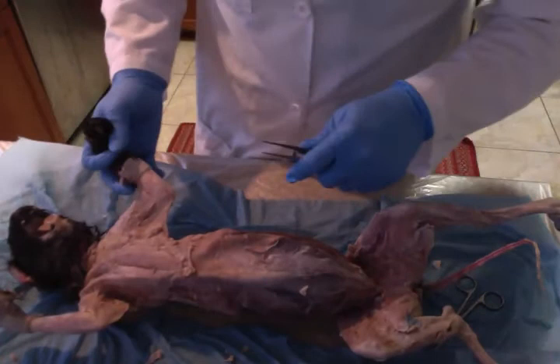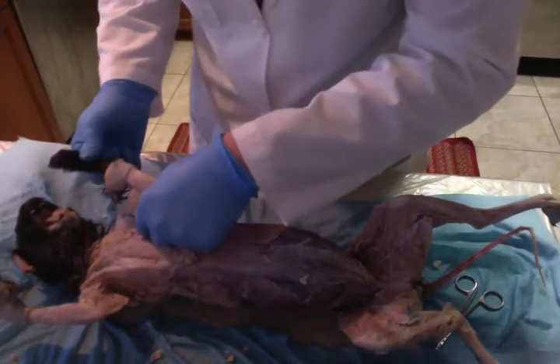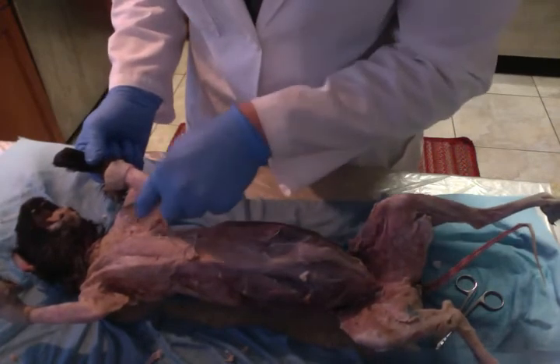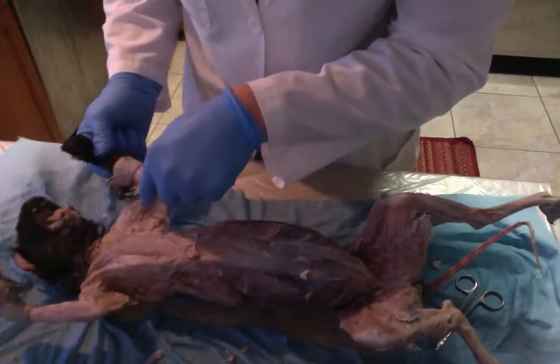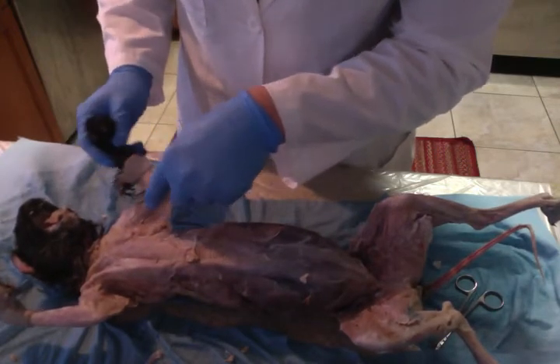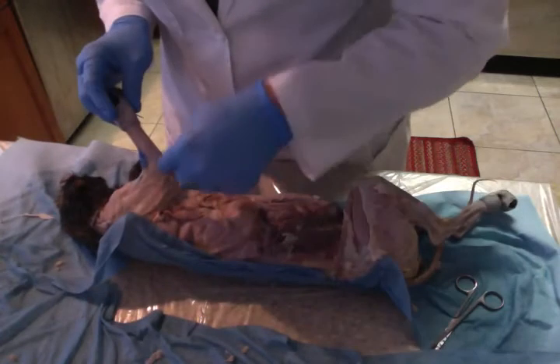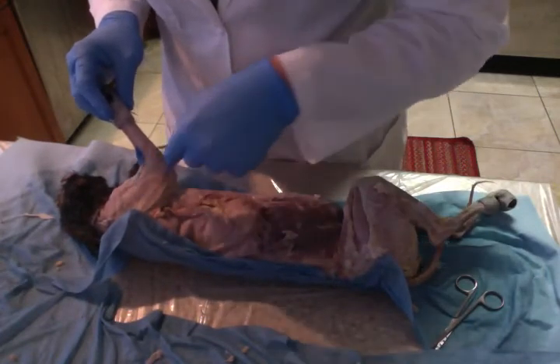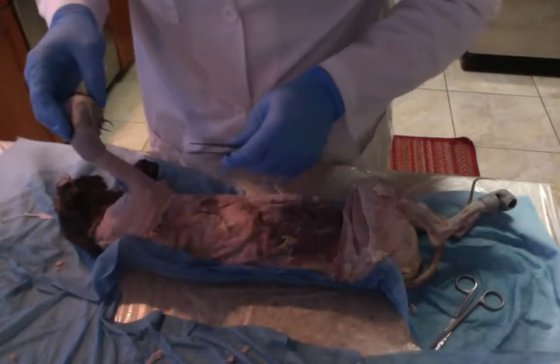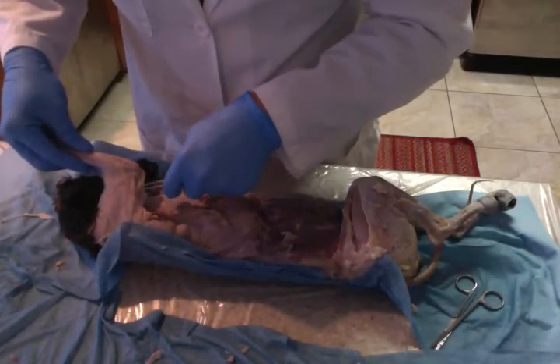We're going to do the biceps brachii, which are right here. Then we have the brachialis — the brachialis right here is the long muscle. And then we have the tricep brachii right here.